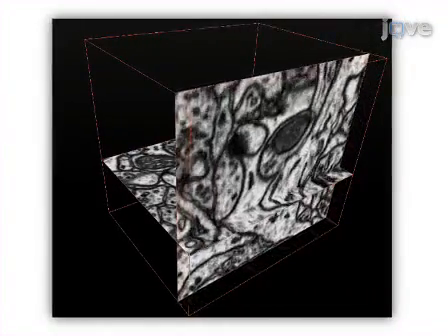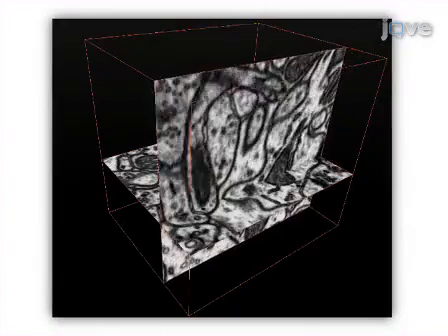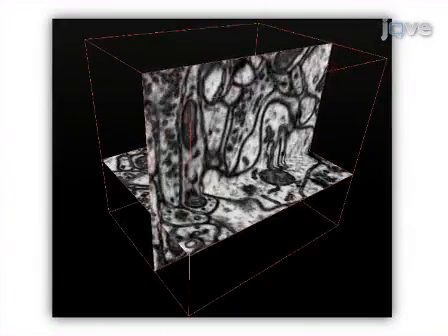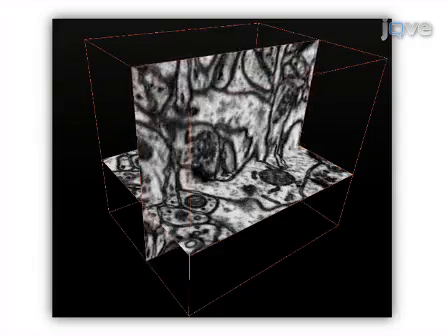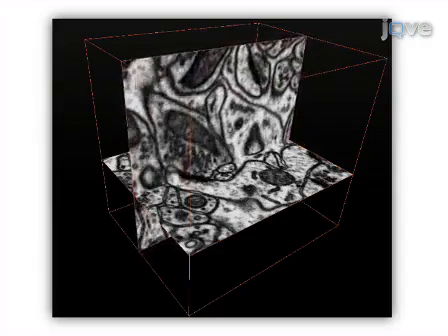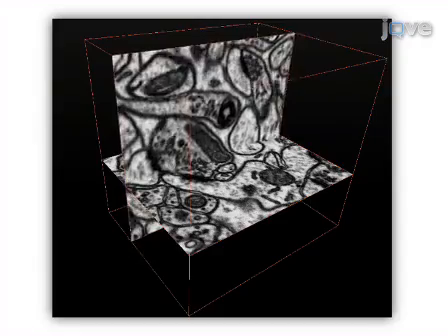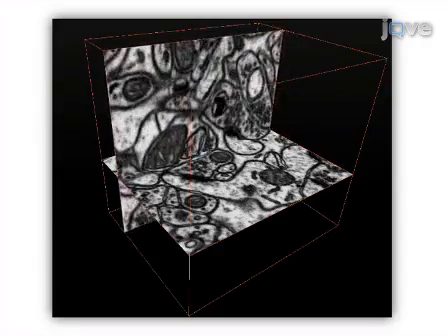Ultimately, results can be obtained that show serial images through a region of interest. The image series is collected automatically and the dataset typically has isotropic voxels so that the image structures can be viewed from any angle in the stack.